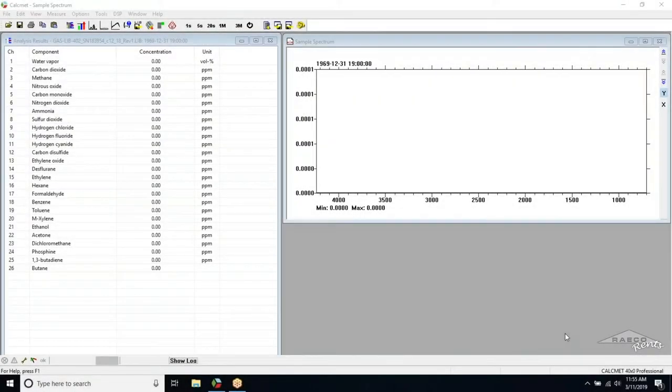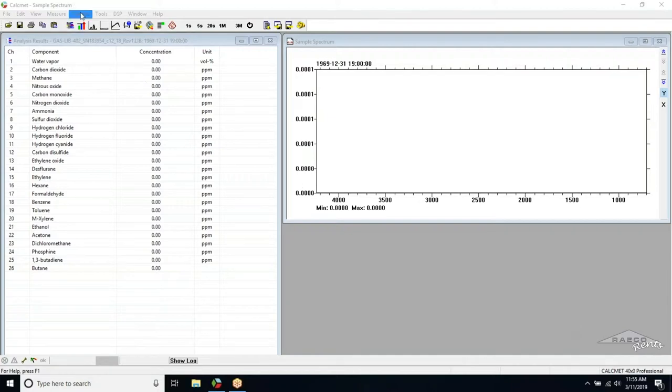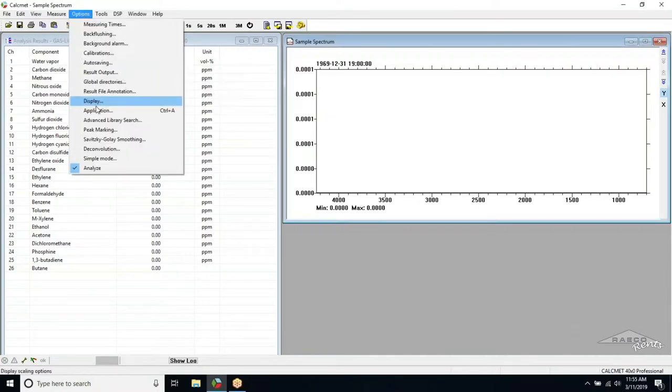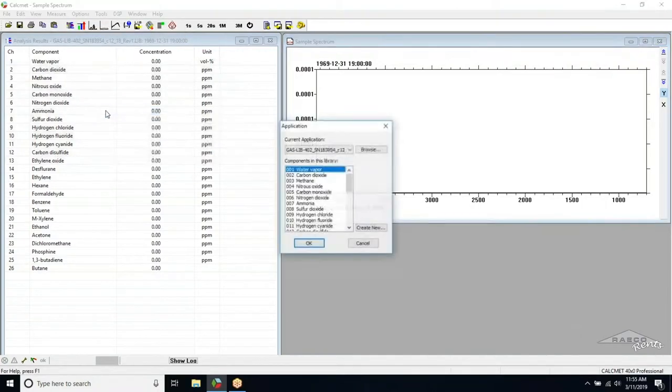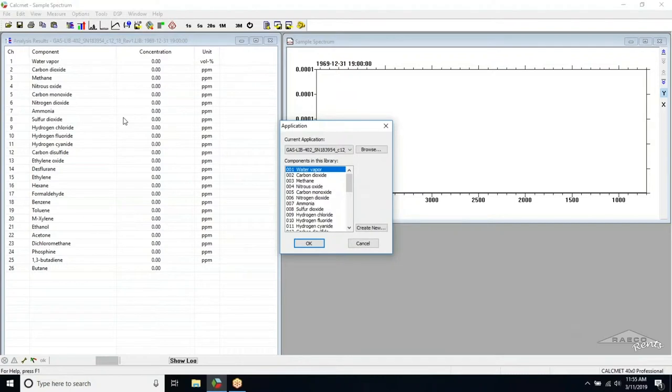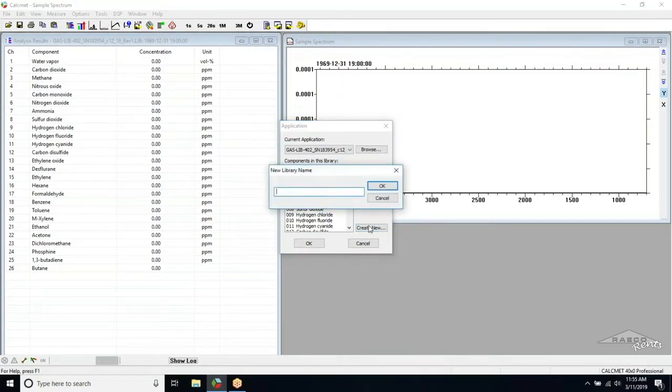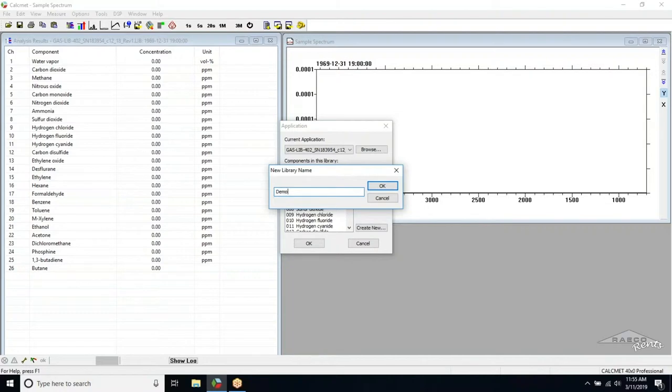The first thing we need to do after opening the CalcMet software is navigate to Options and then Application. To create a new library, click the Create New button and title the library with whatever name you wish. For the sake of this demonstration, I will simply call the new library Demo. Once you have titled the library with the name you wish, you can hit OK on both windows.